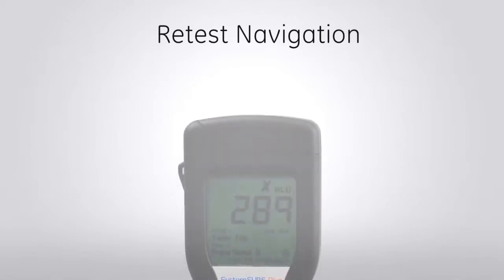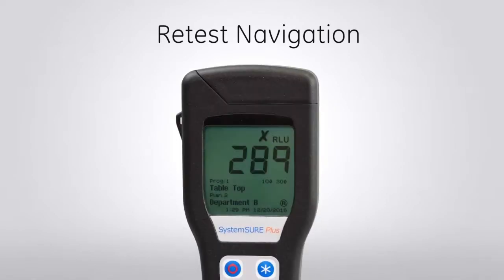When ATP test results do not pass, a corrective action such as recleaning should be performed. After the corrective action, it is important to retest that location and keep a record of the retest result. This video will show you how to conduct a retest on a Hygiena Luminometer.